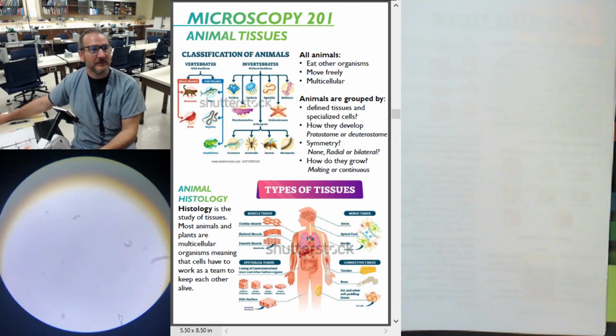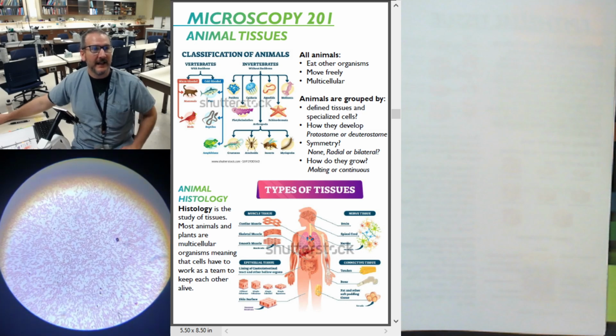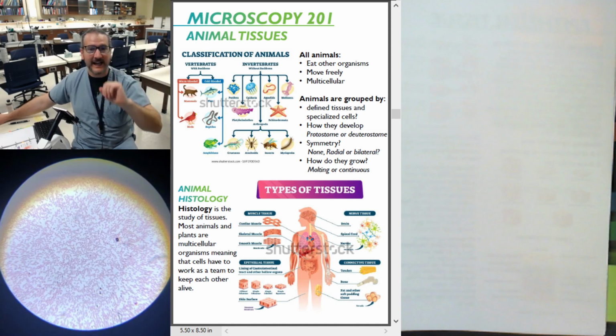Okay, wow, it just seems like a big pink blur, right? So what knob am I going to use now? I'm on the 10x objective, so 100 total magnification. There we go. I use my fine adjustment knob, and you can see that pink isn't just a sheet. It's kind of like when we looked at the pictures in 101, where a picture from a distance looks like a picture, but you come in close and you actually see all those little tiny specks. It's exactly the same thing.